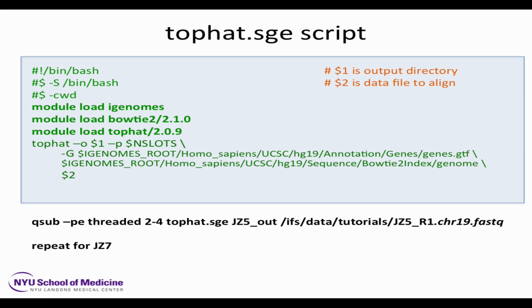And you'll have to massage the data more at the end of the analysis process. A lot of people don't want to do that. They don't want to discover novel isoforms that have very few RNAs associated with them. They'd like to know the expression levels of known genes. So we stick with the -G for most of our people who just want data that's compatible with what's already known about the genome.